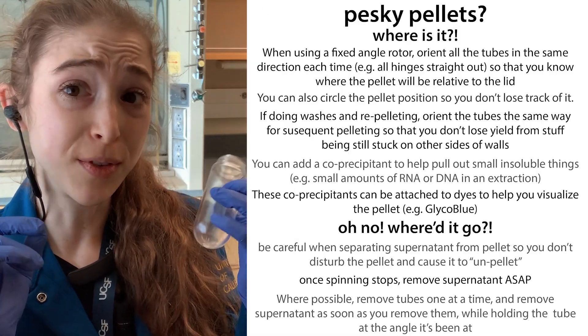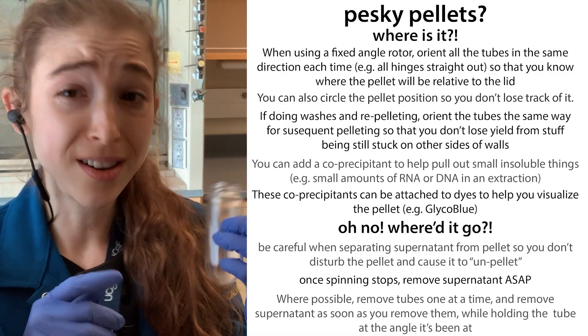Pesky pellet problems? Here are some tips for how you can become a superstar of the supernatant.